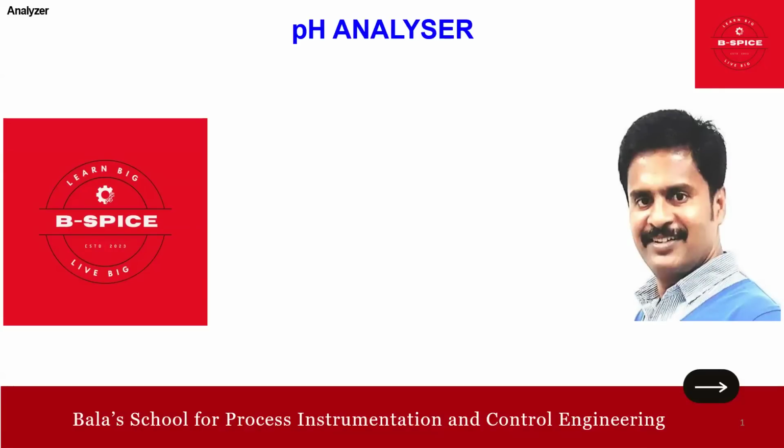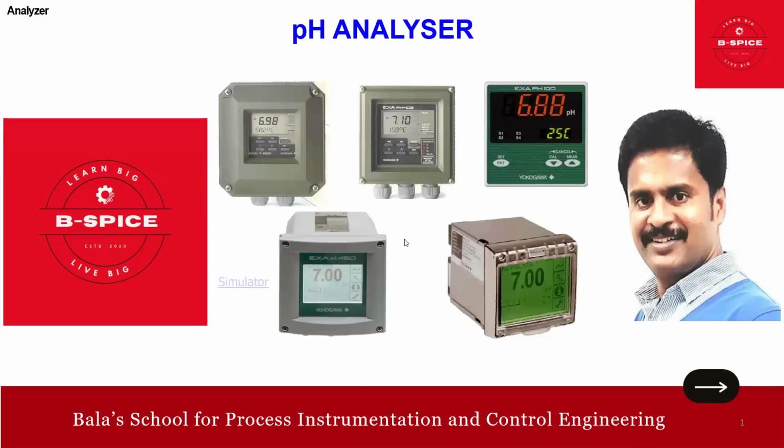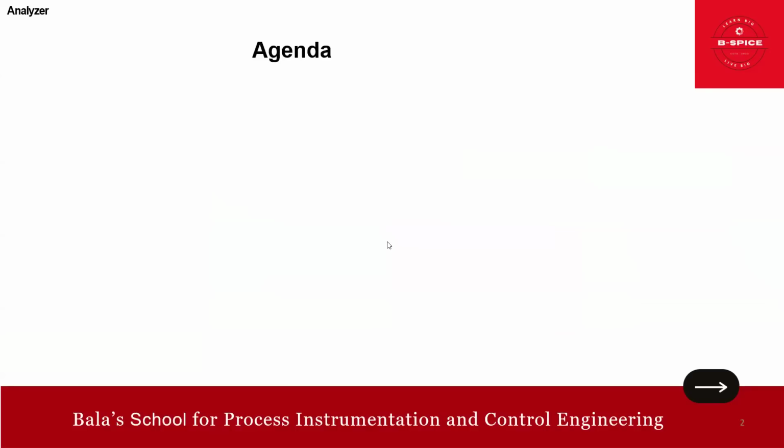In this session, we are going to talk about mastering analyzers, wherein we'll focus on the pH analyzer. The analyzer topic is a long pending one, friends, so that is why I thought of bringing you this item, mastering analyzers. We will start with pH, then we'll go to conductivity, then ORP, like so. All kinds of analyzers we will cover in this session. Okay, so let's move on with the agenda.